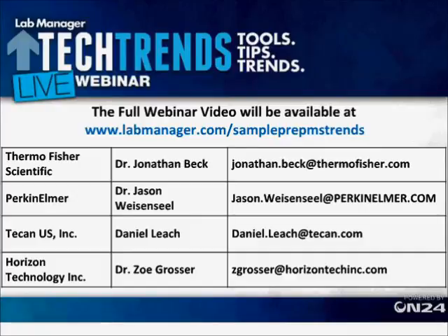I think that the EPA is moving in that direction as well. Certainly in some of the methodology that they have written, they have talked about using less than 1,000 mL, something like 250 mL for an automatic sampler, 40 mL for headspace. So I think there is some movement in that direction in the environmental market too.